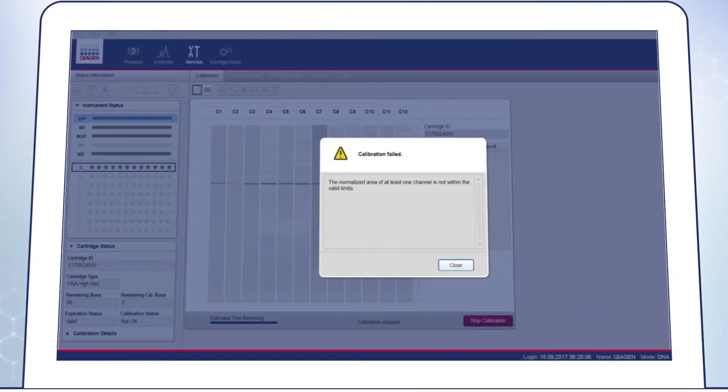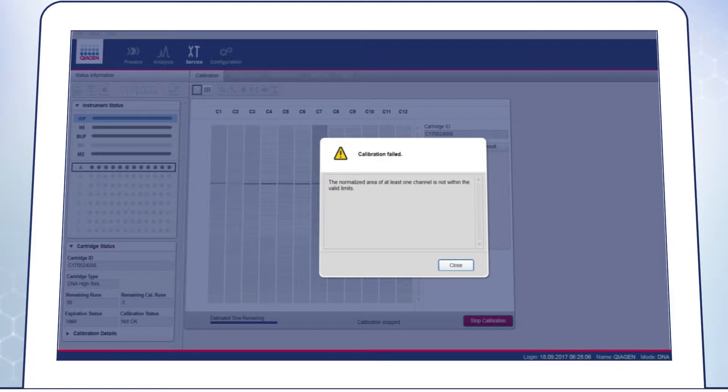If the calibration of the cartridge fails, if one or more positions show high background, or if you see ghost bands, this is usually due to dry gel which blocks the capillaries.